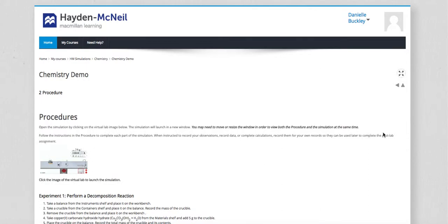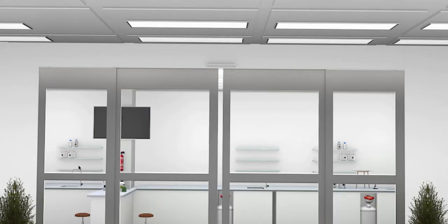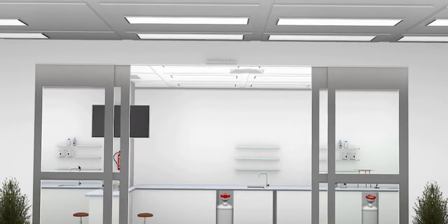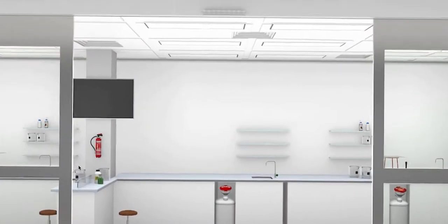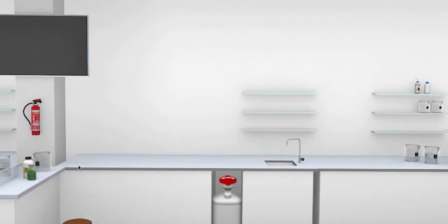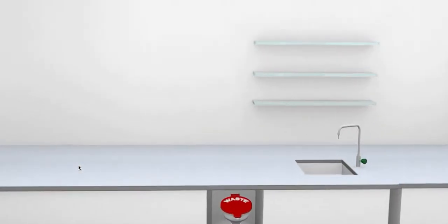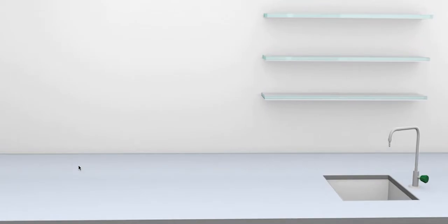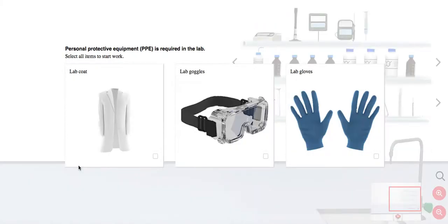The procedures page is also where the icon exists to launch the lab simulation. When students enter the lab, they'll first see the personal protective equipment prompt.